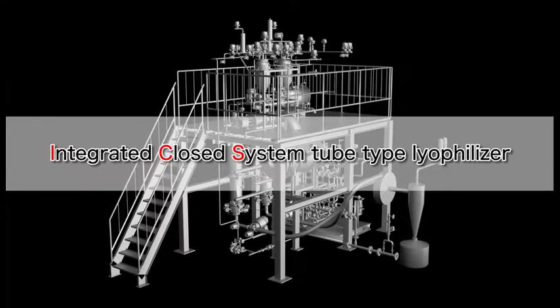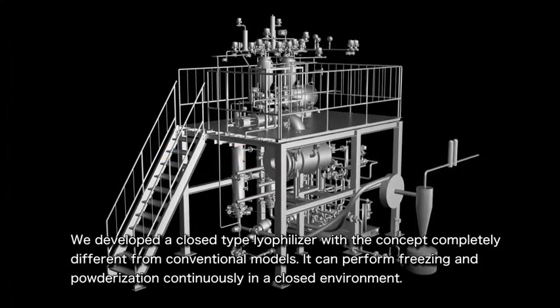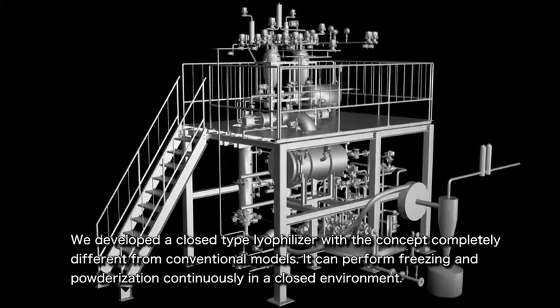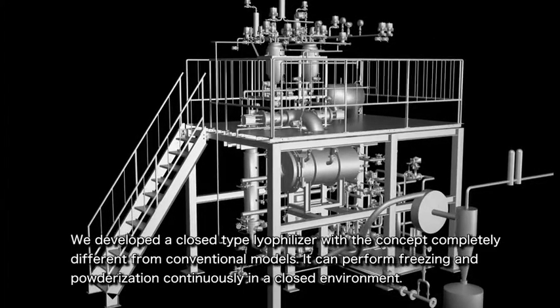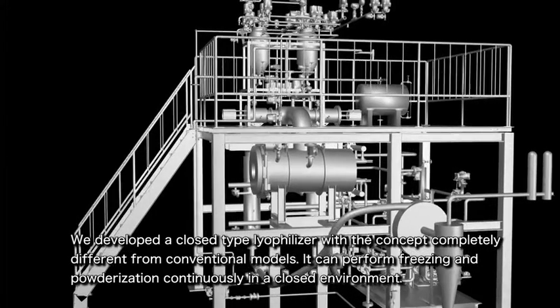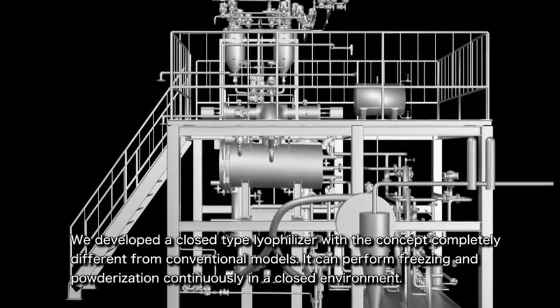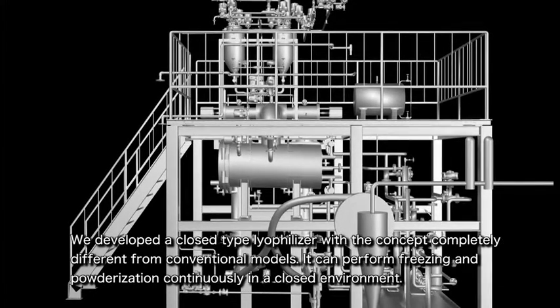Here we will explain about ICS, the Integrated Closed System tube type lyophilizer. We have developed ICS, a lyophilizer with a concept completely different from conventional shelf type models. ICS can perform both freezing and powderization in a totally sealed environment. With this lyophilizer, the processes from lyophilizing to crushing can be done in a general air conditioned area.